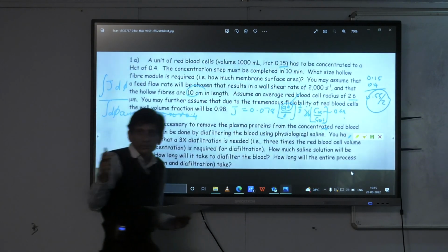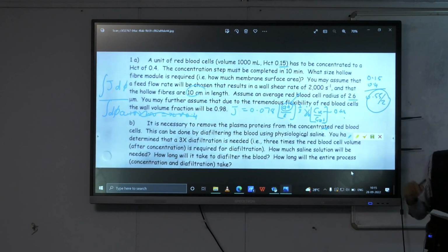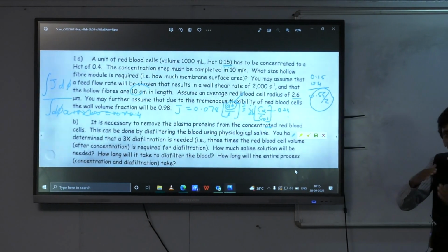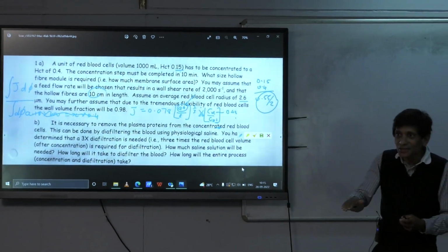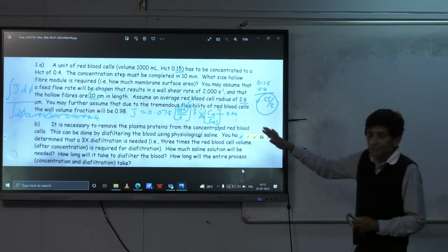So all of you who are engineers should have seen that somewhere, because who knows the Hagen-Poiseuille equation? Nobody? Somebody must know Hagen-Poiseuille. We must have learned the Hagen-Poiseuille equation, right? So do you remember how you derived it? You derive it by looking at these laminar layers, if you like, flowing through, and you integrate through the cross section of the tube. Same sort of thing we're doing here. So you can find a mathematical average, okay?